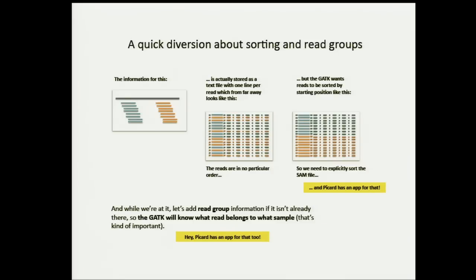So there is a tool for this. Picard has a tool called AddOrReplaceReadGroups, and you can use it, or you can even use BWA with some quirky parameters to add all the tags of the read group to your file. But this is really important. It needs to be done because for all of the subsequent analysis steps, we need to know which sample these reads came from, lane, platform unit, and all the details that the read group provides to the GATK.